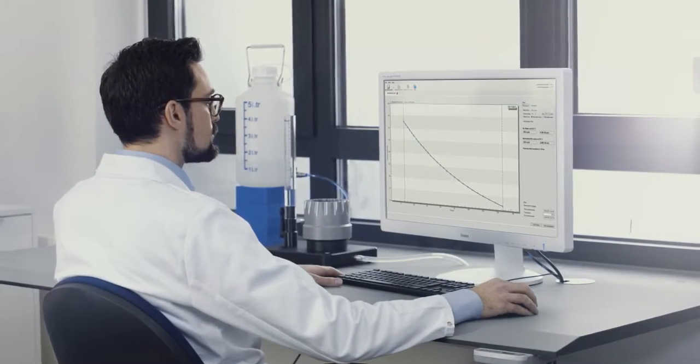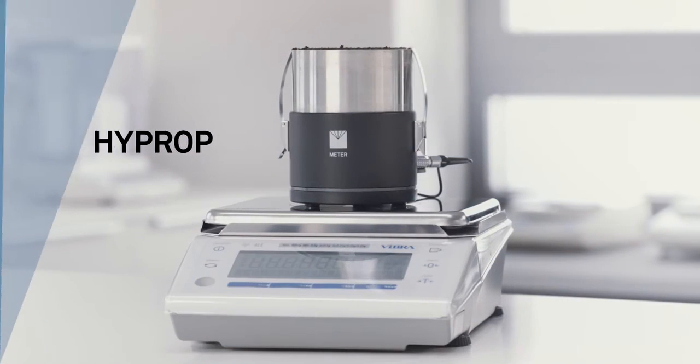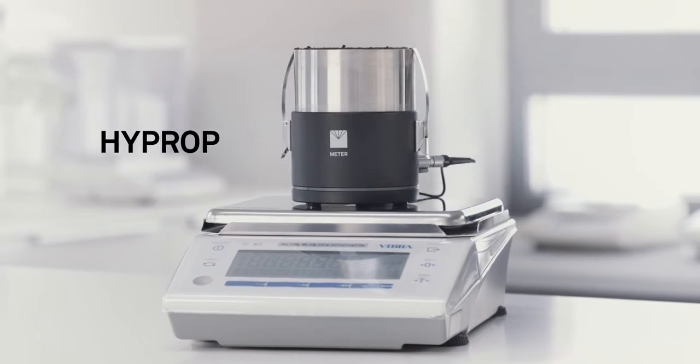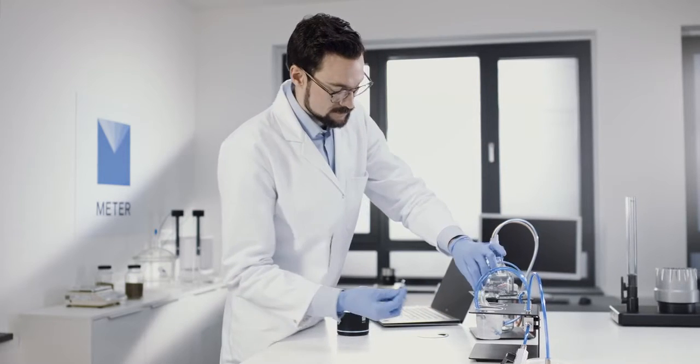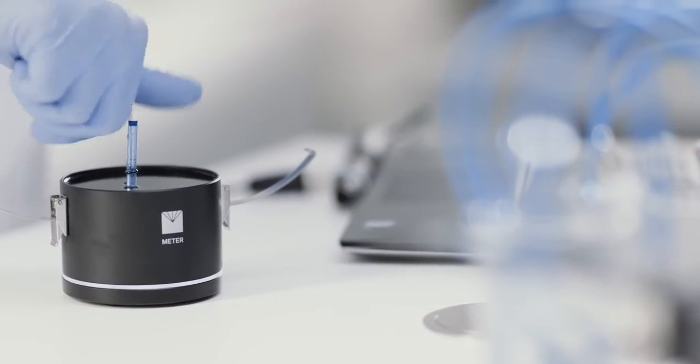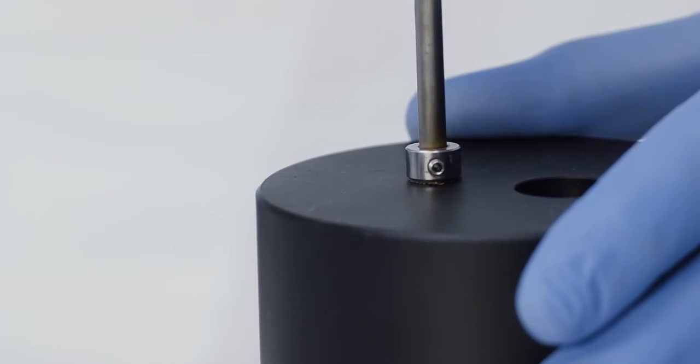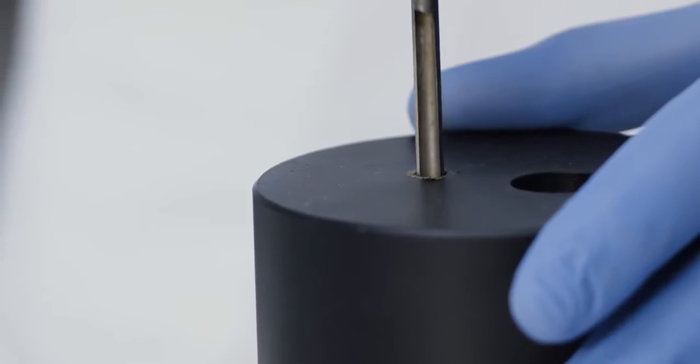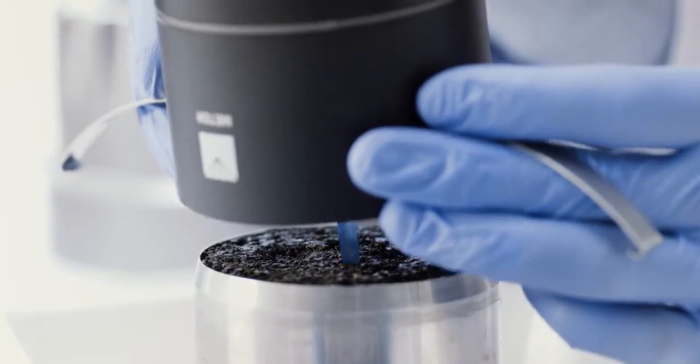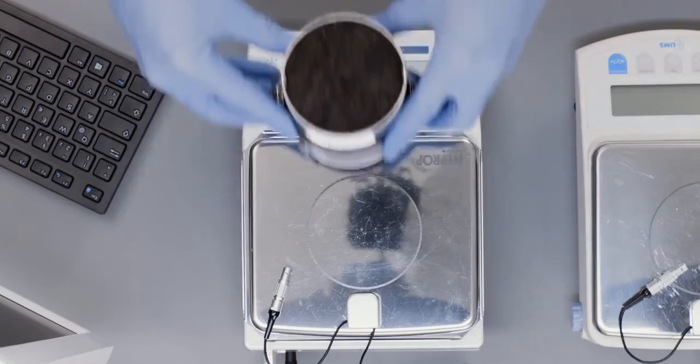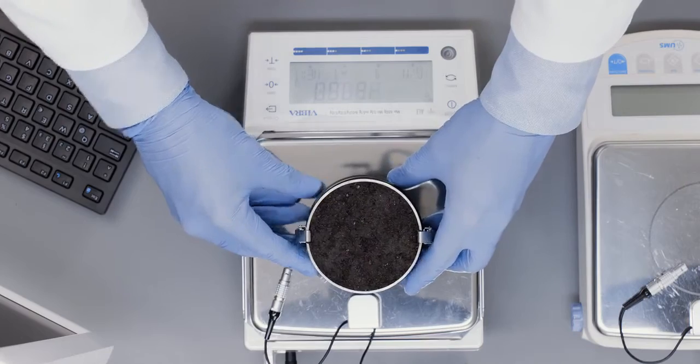Prepare the HyProp, fill it, and connect the tensiometer shafts. Take the sample from the KSAT, auger the holes, and clamp on the HyProp base. Put it on the scale and connect the HyProp.